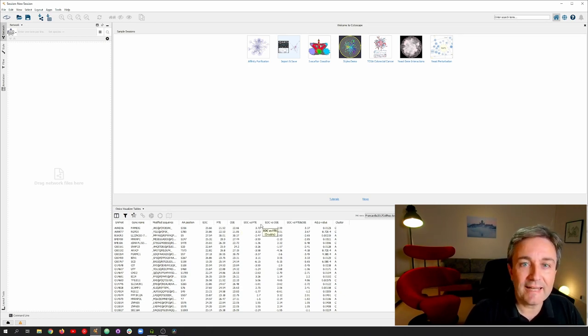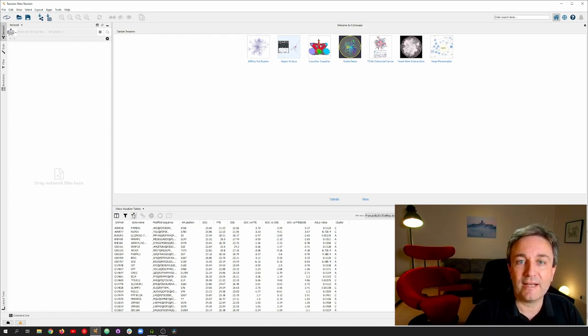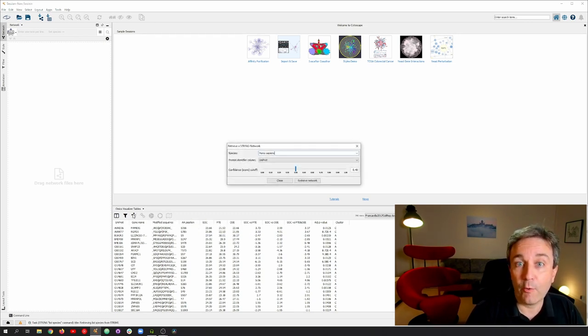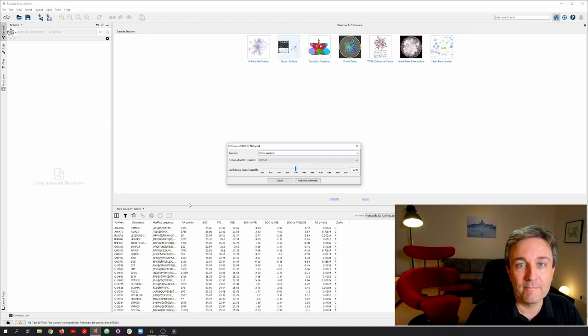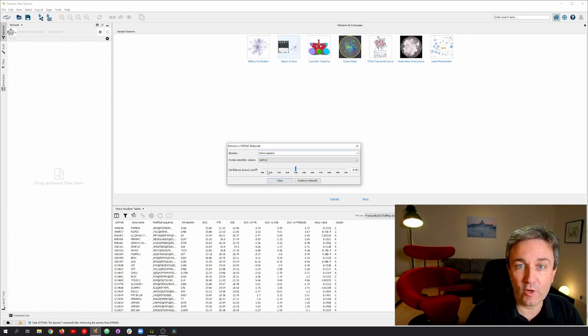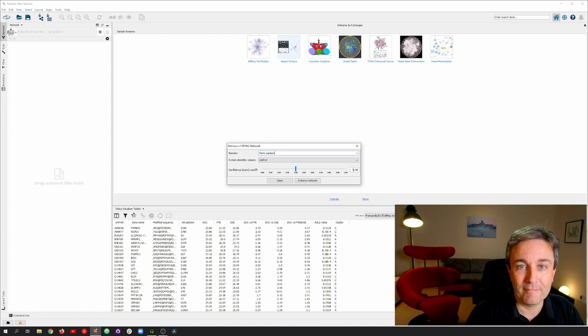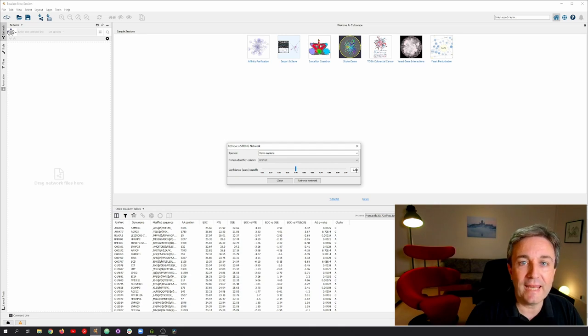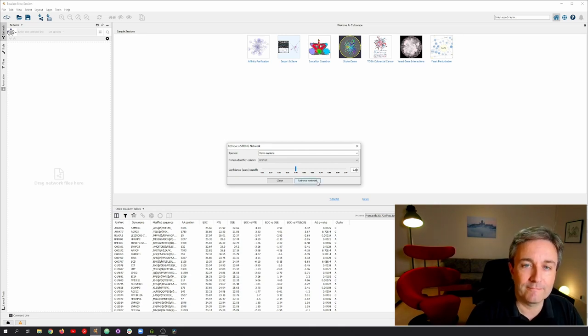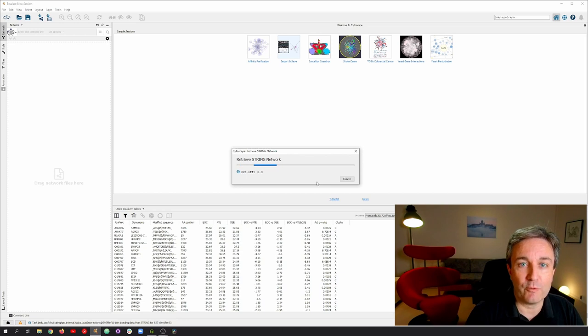If we click the String icon inside the Omics Visualizer table, we get a dialog allowing us to use String App to easily retrieve a String network. It has already selected Human as the default organism, and UniProt as the column to use to query with names from. I thus only need to adjust the confidence threshold, which I change to 0.8, and click Retrieve Network. A short moment after, I get the String Network.